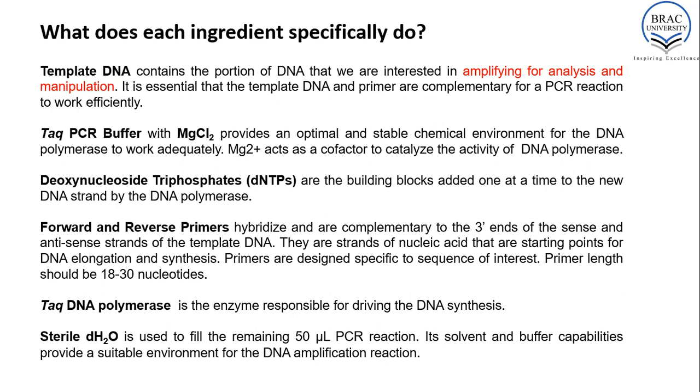The amount of template always varies from picogram to nanogram level. For plasmid, you can use just 1 or 10 picograms of plasmid DNA, which is sufficient to check either the plasmid or the DNA fragment.